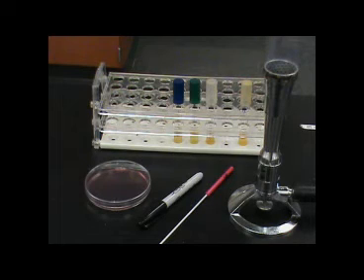MacConkey agar is used in diagnostic laboratories for the detection of coliforms in the presence of patient samples. Again, it is both a selective and differential media. Other forms of MacConkey may use other carbohydrates instead of lactose for the detection of specific coliforms. Sorbitol is substituted for lactose in some MacConkey agars to detect the presence of E. coli O157:H7. MacConkey agar may be modified in other ways to detect the presence of other specific gram-negative enteric coliforms.